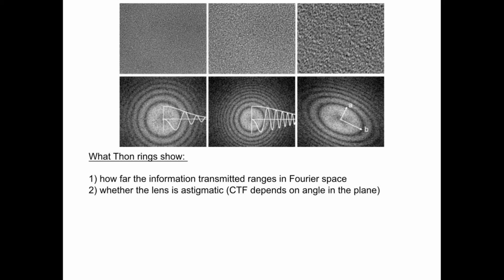And since it's so cumbersome to figure out automatically for thousands of images how exactly these are arranged, the astigmatic images are normally simply discarded. And in fact, nowadays electron microscopes are very sophisticated, and the correction of axial astigmatism can be done in a very convenient way. Theoretically, one could make use of this information.